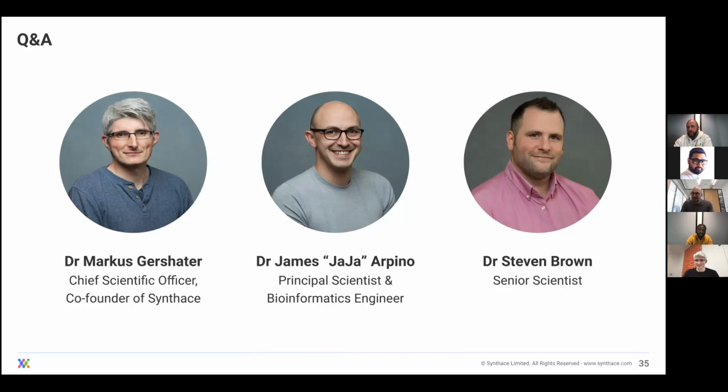I thought it was absolutely fantastic. Thank you, Steve. Getting going is really not that difficult, and there are digital tools out there, which Steve has shown today, which are a great place to start, to even just play with the concepts of DOE outside of the lab before you step in and apply it to your real biology.